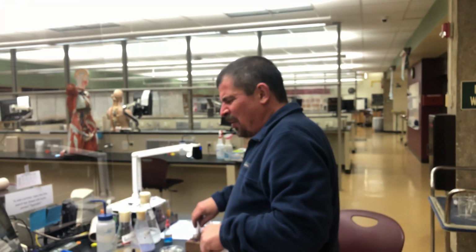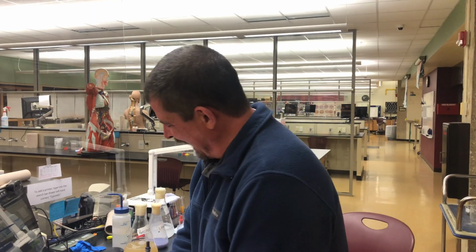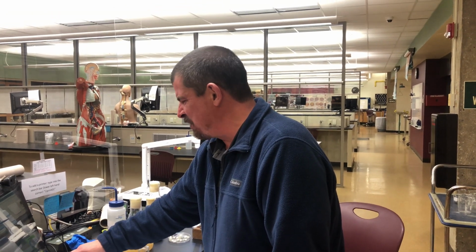And so again, folks, which tube shows an indication that chemical digestion of protein has occurred? That would be test tube number 2, because that is what contained the pancreatin. And so then, what pancreatic enzymes are responsible for the beginning of the digestion of protein? There are 3 enzymes that are found in the pancreatin that are responsible for protein digestion. And the first one is trypsin, the next one is chymotrypsin, and the third one is carboxypeptidase.